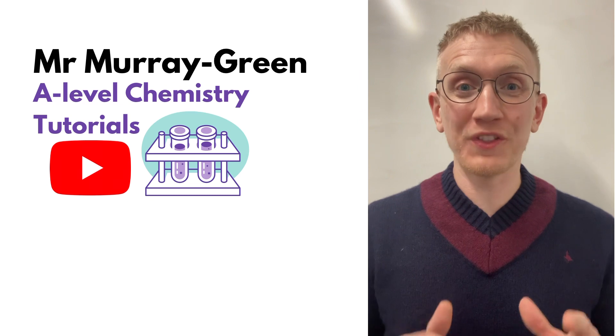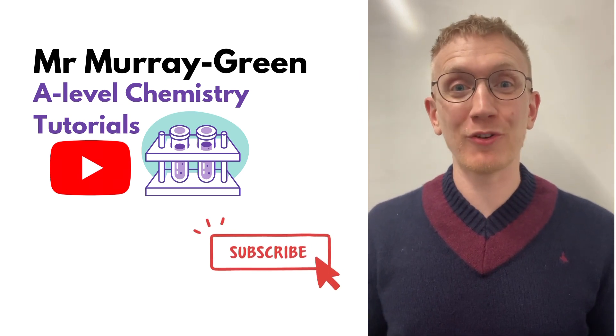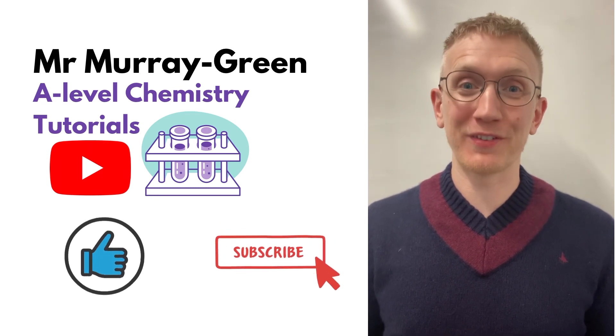In this tutorial, I'll give you all the guidance you need for your OCR A specification in A-level chemistry by preparing a solution of 0.1 mol per decimetre cubed copper sulfate.